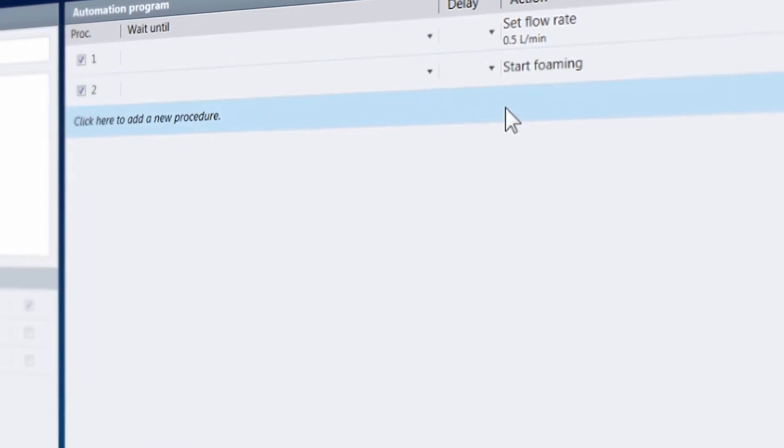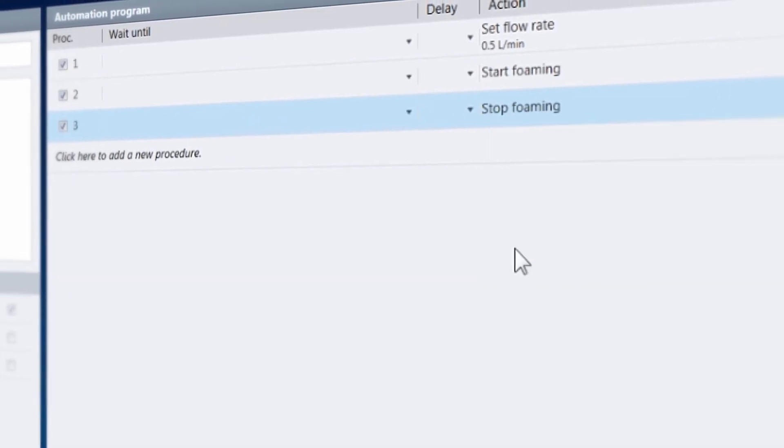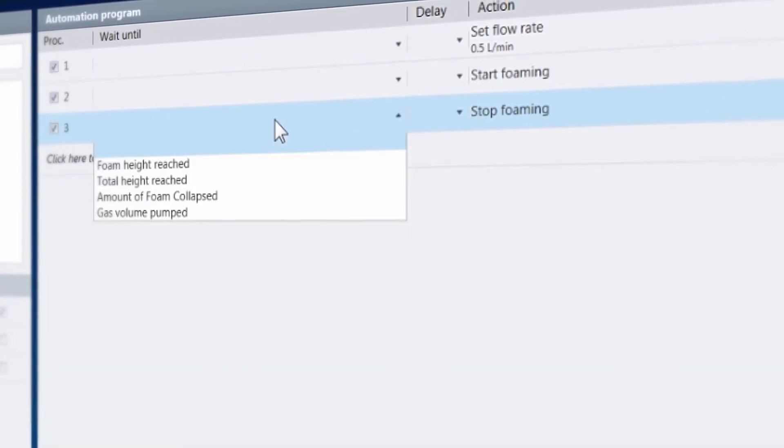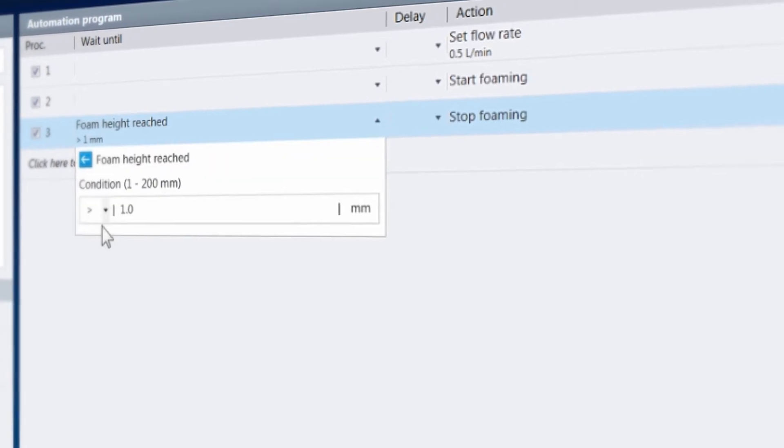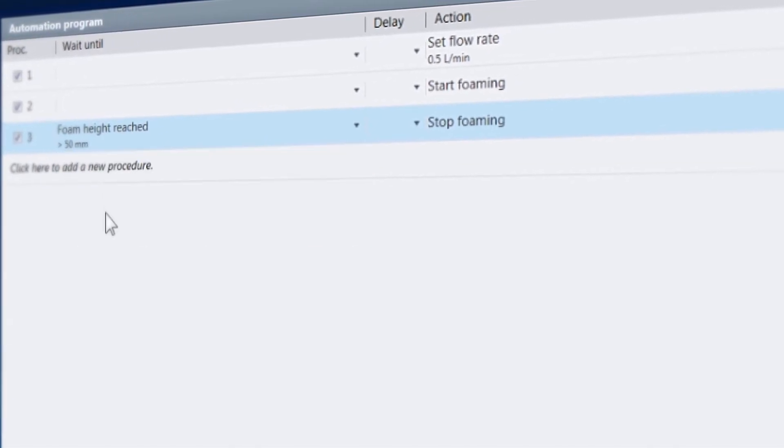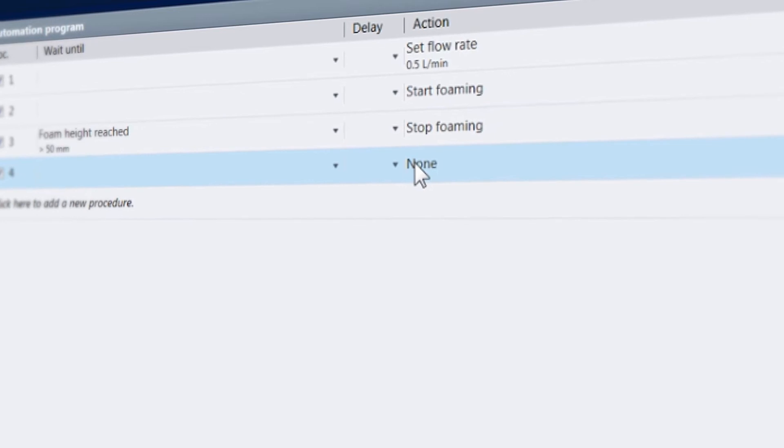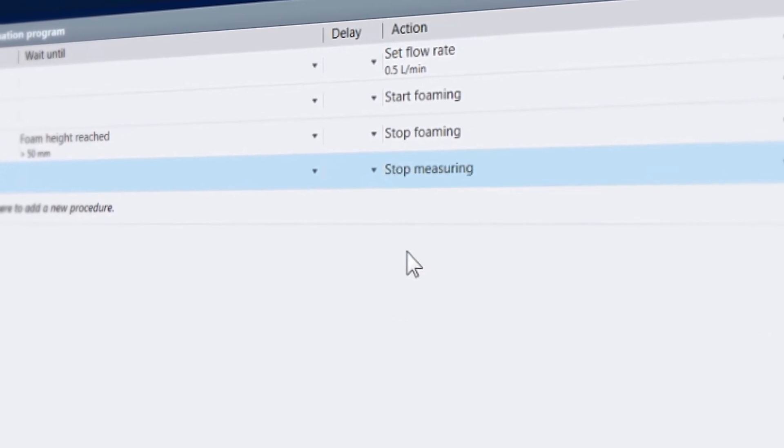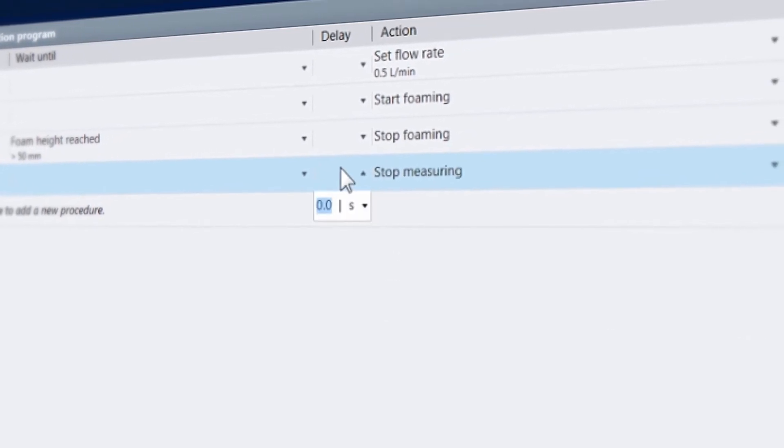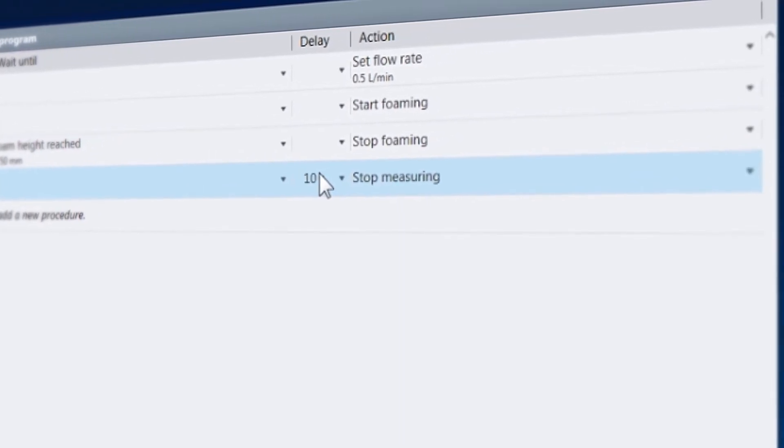Using the ADVANCE software to run a foam analysis means that every step of the measurement can be completely automated, which saves time, makes analyses totally reproducible, and bypasses the possibility of operator error.